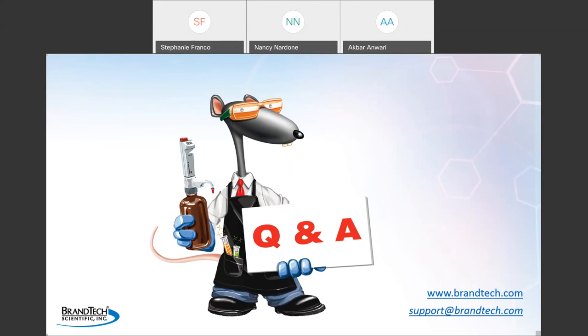Okay, one more question. When I received my burette, there is a calibration certificate. Why isn't the actual gravimetric result sent with it? If you're talking about a Brand instrument, Brand provides certificates of performance. They don't provide full calibration certificates. That's simply their policy. The instruments are calibrated. They just provide a certificate of performance, which provides mean data.